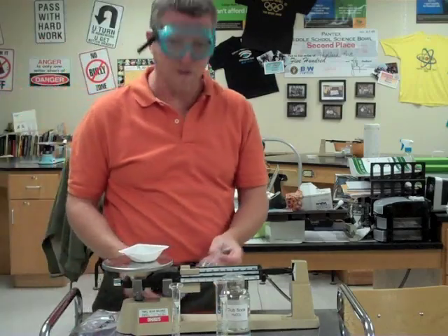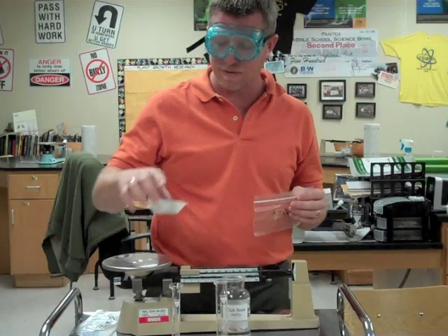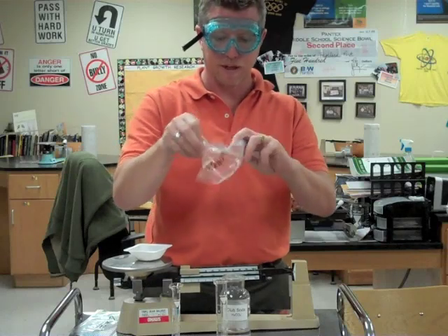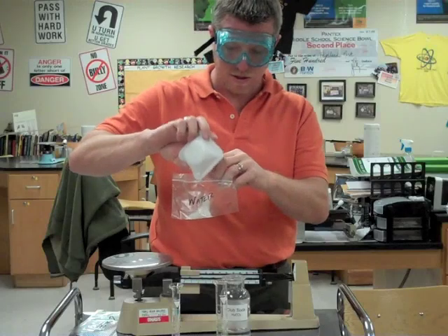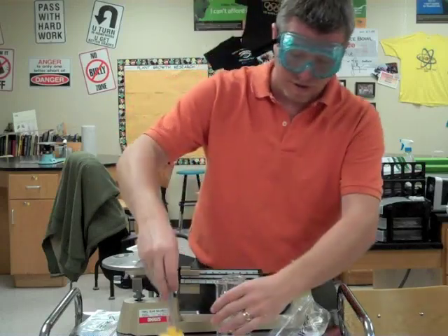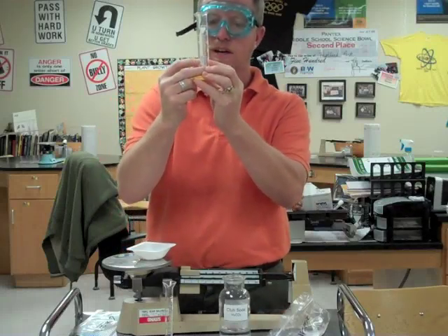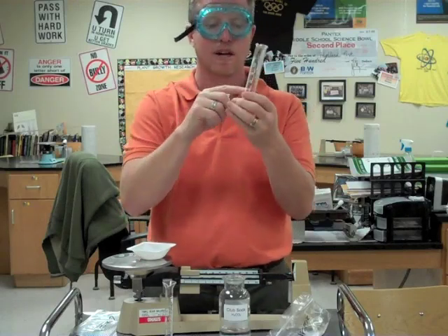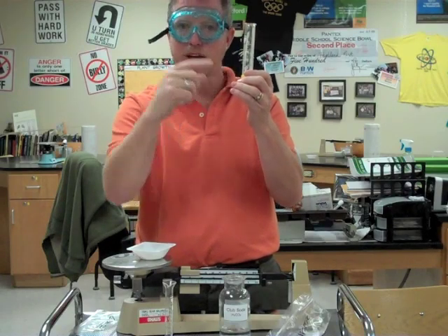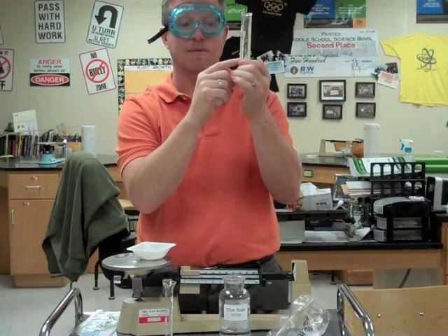Remember, any time we're using chemicals, we want to make sure we're wearing our safety goggles. Now I want to take the 5 grams of chalk dust and pour it into this bag labeled water. I'm wanting to measure out 10 milliliters of water right here. Remember, when using a graduated cylinder, we want to make sure the bottom of the curve — the meniscus — of the liquid is what we read, and we want to do it on a flat surface.